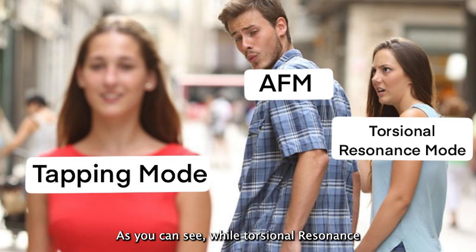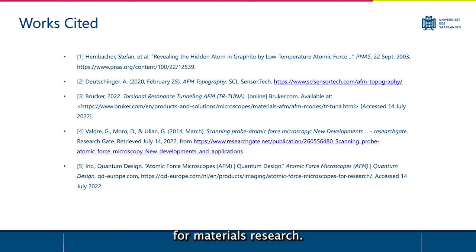As you can see, while torsional resonance AFM is not the most used or important mode, it has its specific uses and opens up many new doors for materials research.